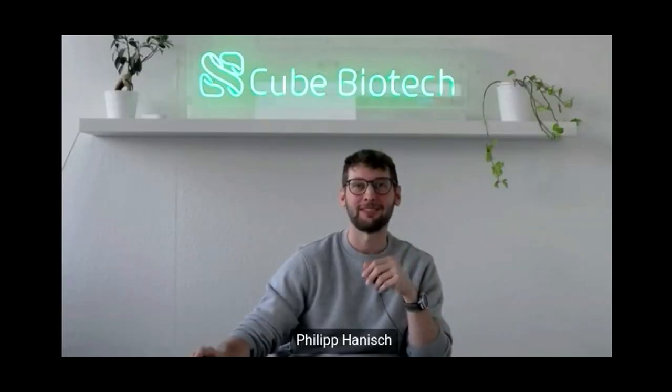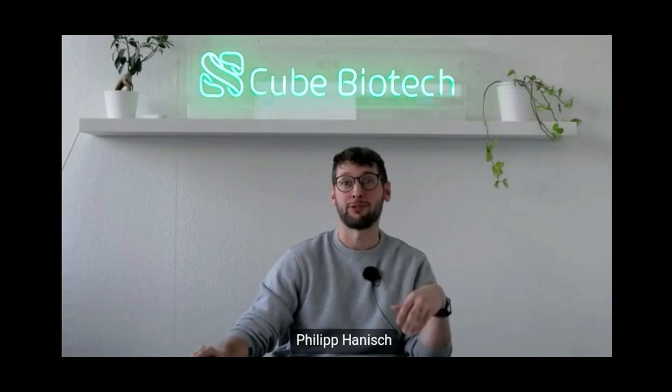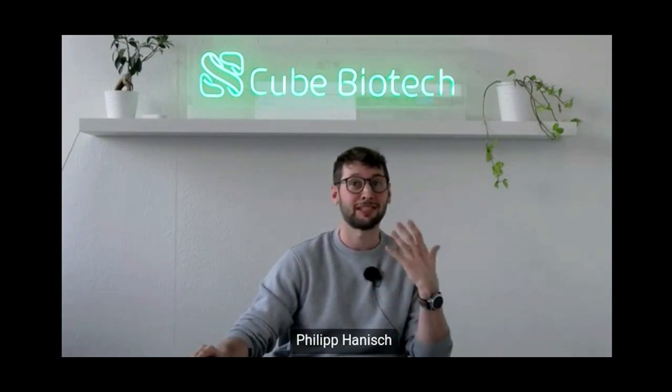Yeah, of course. There are a lot of challenges. You cut through, but yeah, there are more, and I'm happy to answer this. If we're talking about purifying and having issues of stabilizing it, you're also going to end up with a limited availability of functional membrane proteins. And even if you have successfully expressed and purified them, you have to keep them in a functional state to get really accurate binding studies, because how would you know?